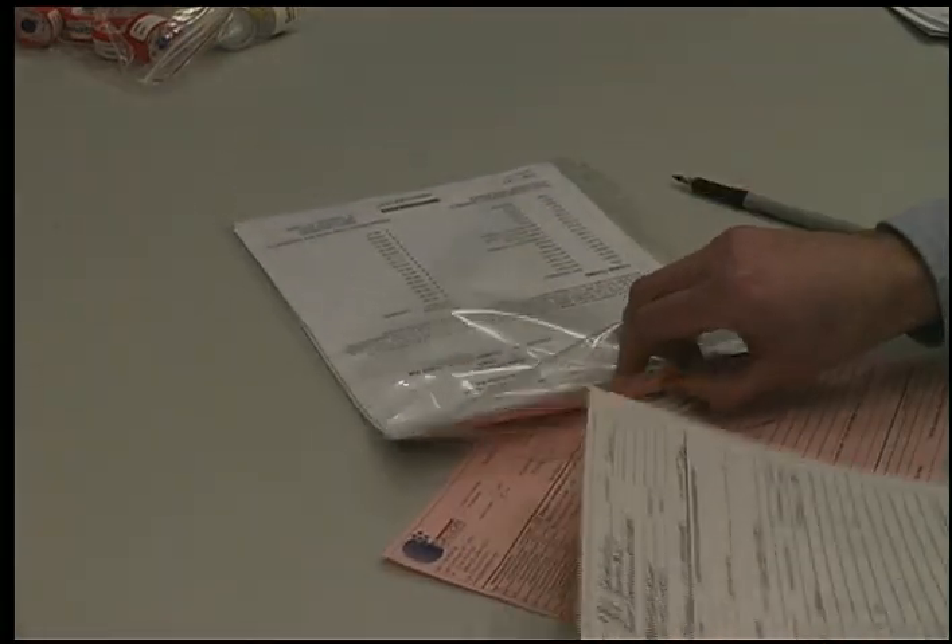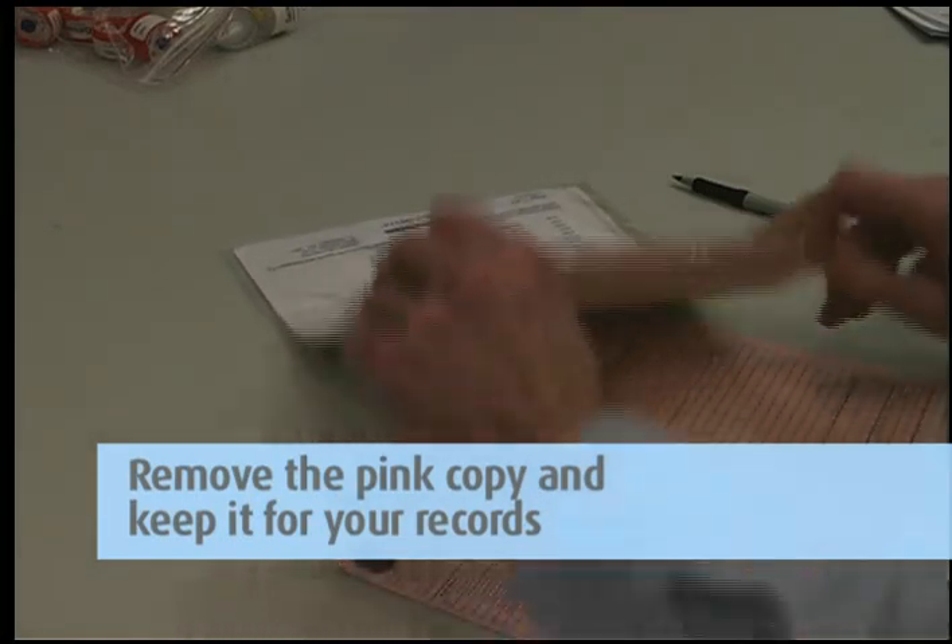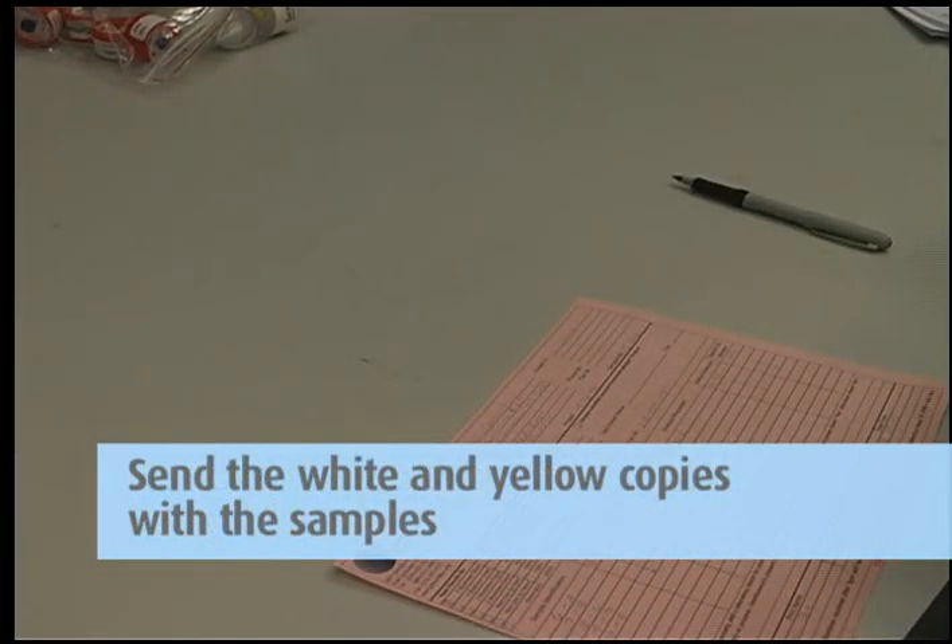Then complete the chain of custody form. It is important that you include all the information requested in order to ensure the turnaround time of your samples. Remove the pink copy and keep it for your records. Send the white and yellow copies in with the samples to the lab in the large zip-lock bag.